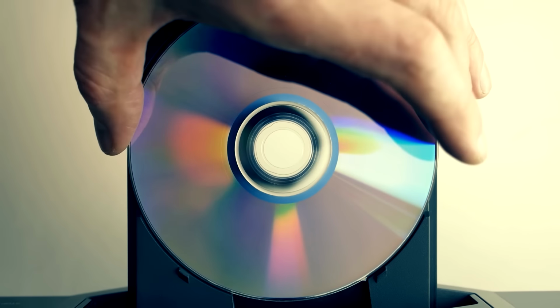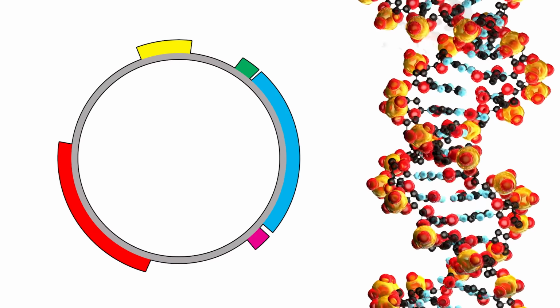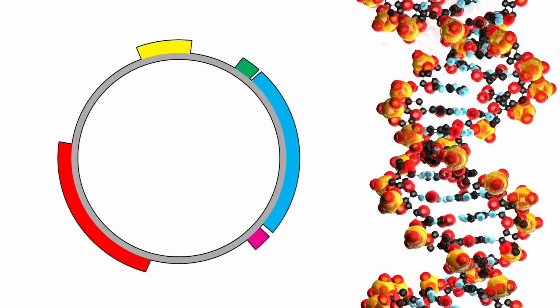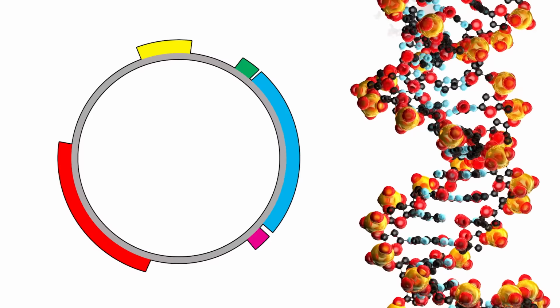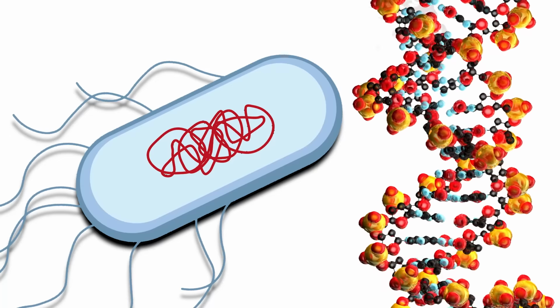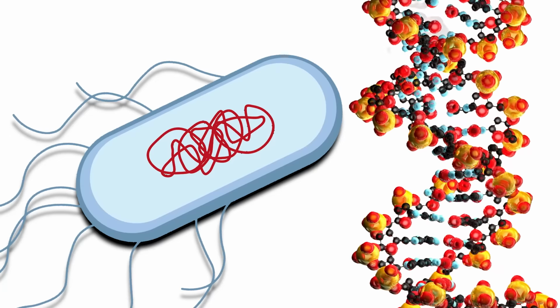Think of all of this like installing new software. Instead of installing virulence genes, we're going to make the E. coli do fun and new things. Now, we're going to be designing our plasmids so that they continue to exist as plasmids. However, it's also possible to design them in such a way that the DNA will end up incorporated into the main chromosome, instead of just floating around on its own. But that's more complex, so we'll talk about that another time.